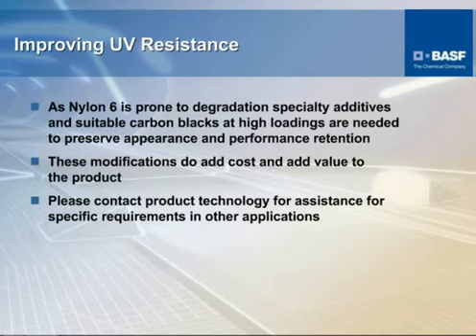As I mentioned earlier, this presentation was generated and programmed around nylon 6 type product, but the test methods, criteria for, and necessity for doing this type of testing pertains to just about every polymer, not only nylon. But in this case, we're talking about nylon, and some of the reasons why we do this weathering is to screen out the necessity for improvement, whether it be stabilization type improvement to improve properties, or some kind of improved color retention. The two biggest facets that are looked at by the end-use customer: surface aesthetics, color, and properties.